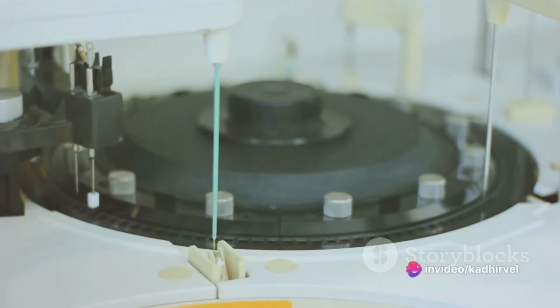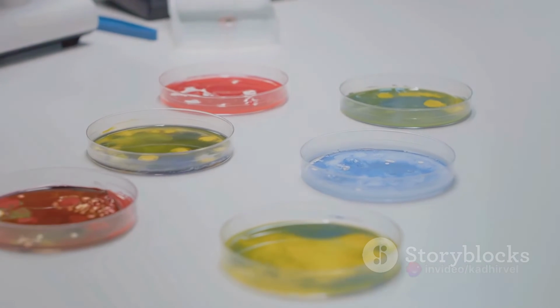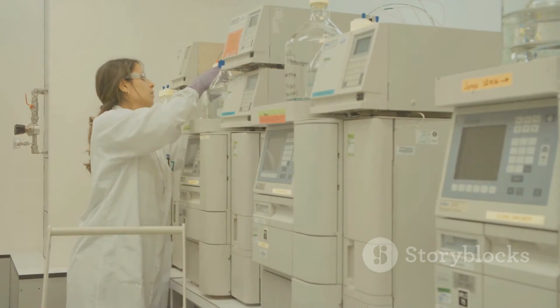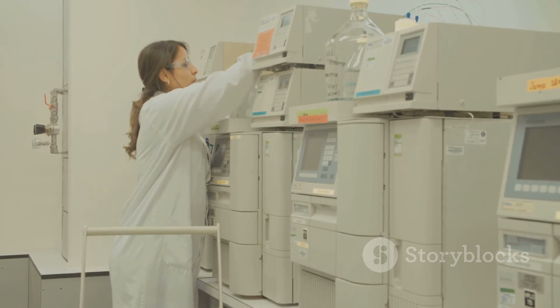To wrap it up, dynamic binding capacity is a fundamental parameter in chromatography. It represents the maximum amount of solute that can bind to the chromatography resin under dynamic flow conditions. The optimization of DBC is absolutely essential for efficient and cost-effective purification processes in the biopharmaceutical and biotechnology industries.